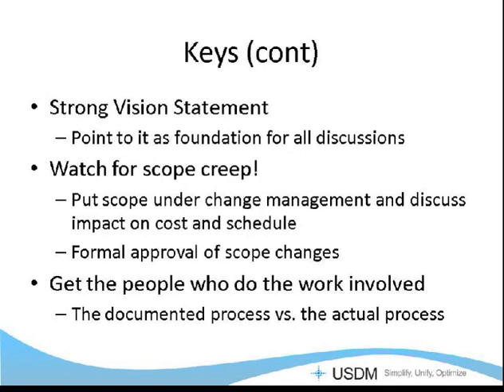Also, this is sort of a basic project management thing, but I think people tend to get away from it. You really need a strong vision statement of what you actually want to do. ELNs are a new thing, and a lot of labs don't quite understand. A lot of management doesn't really know what they're about. So you really want to decide ahead of time, have a lot of discussions about what you actually want to get out of this.